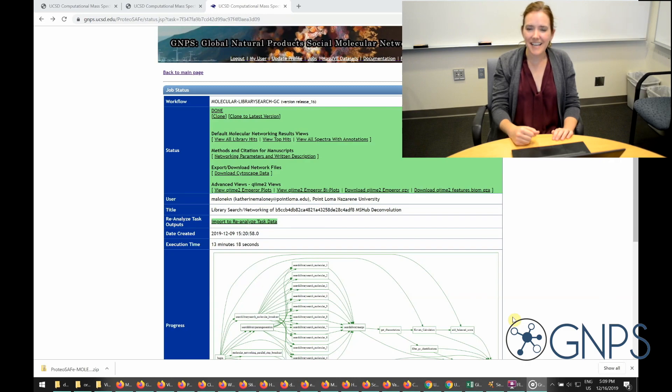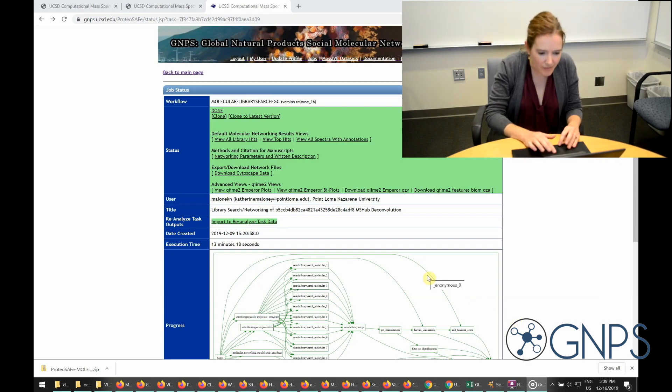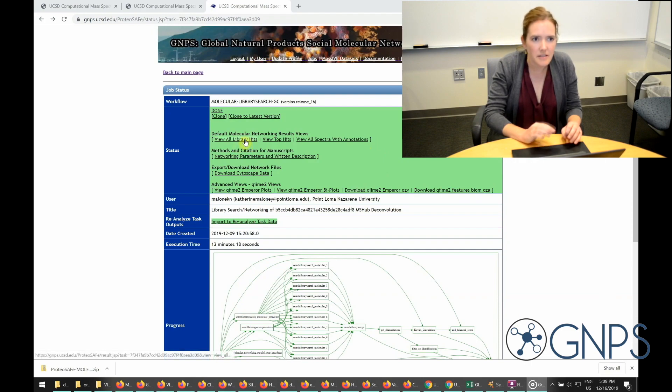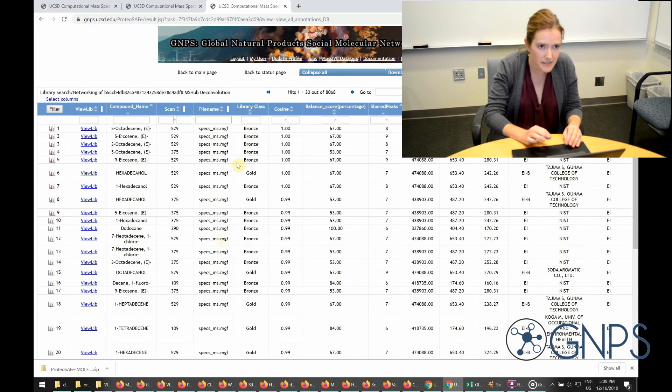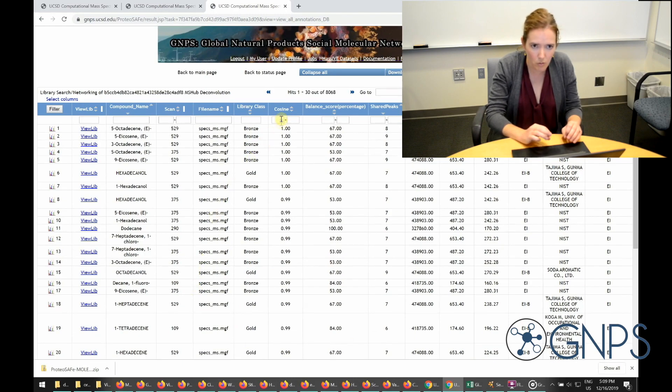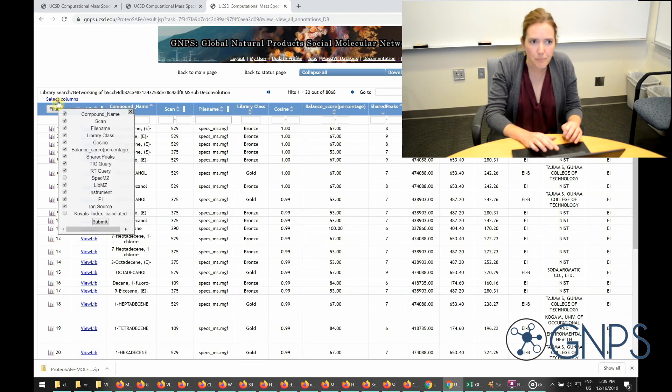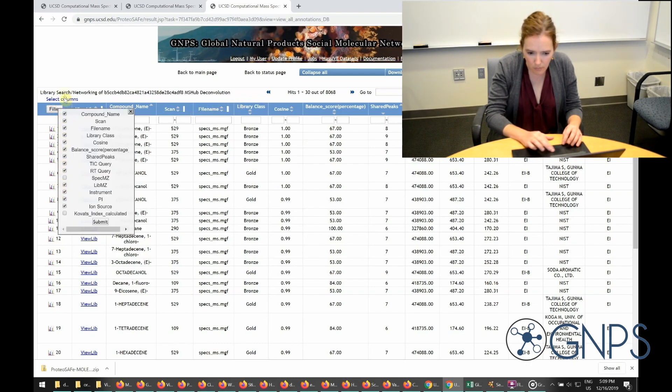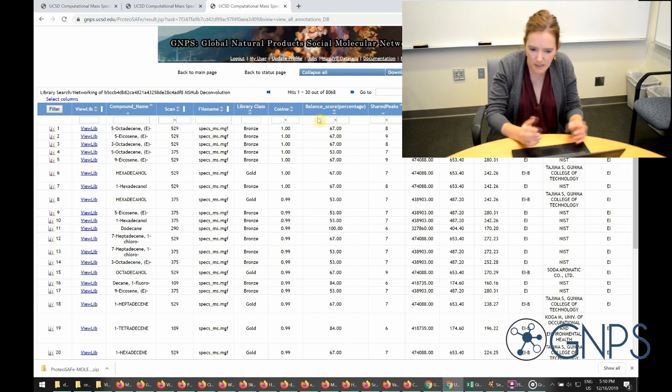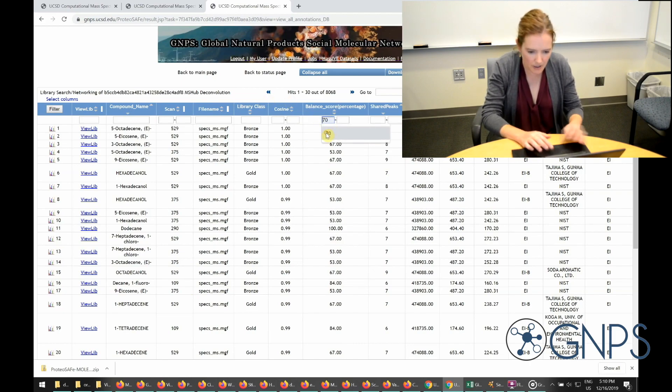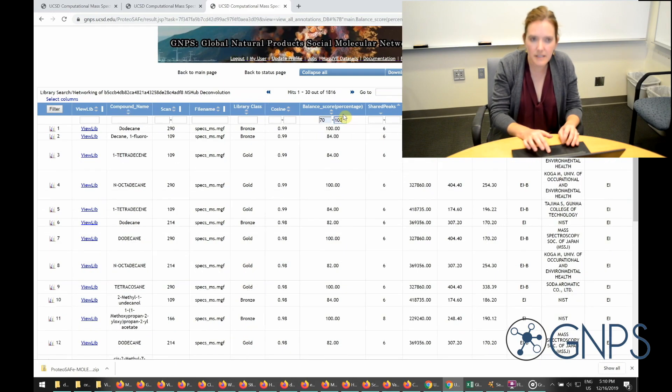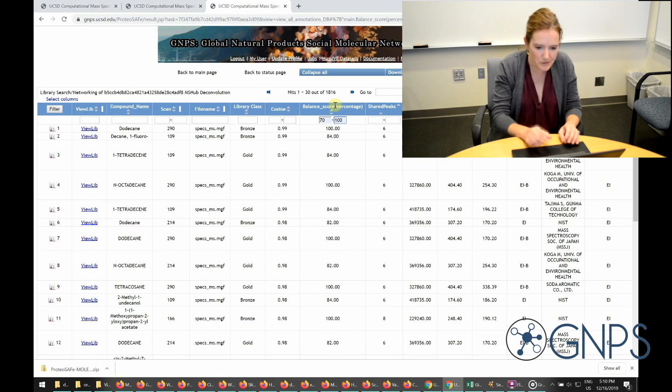Okay, the job is done. So let's have a look. You can see in here I have several views that I could look at. The first one, view all library hits. This is showing me now all of the reference matches, up to 10 for each compound in my data set. By default, it ranks them in order of decreasing cosine score, although I could reorder them by any feature I want to in this table. I can choose what columns I want to display over here. So I might choose, for example, to limit myself only to things with a balance score between 70 and 100, which I can do like this. And so that's going to cut down on a lot of the noise, which is kind of nice.